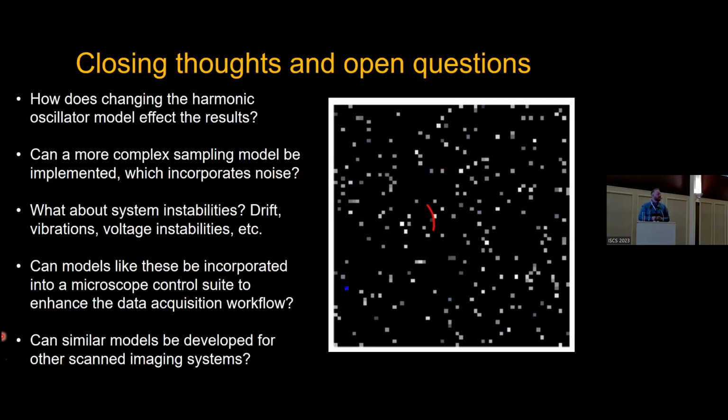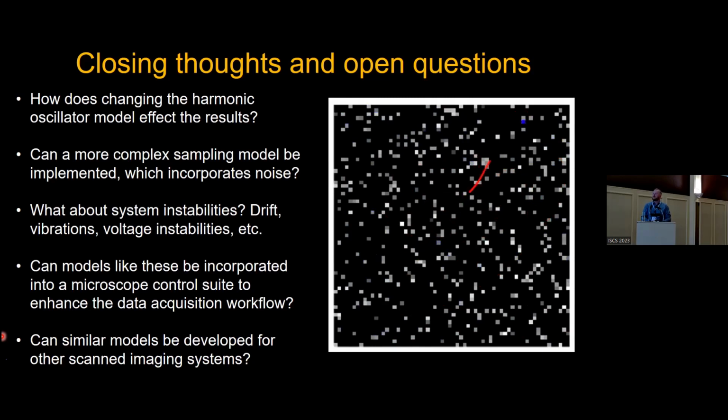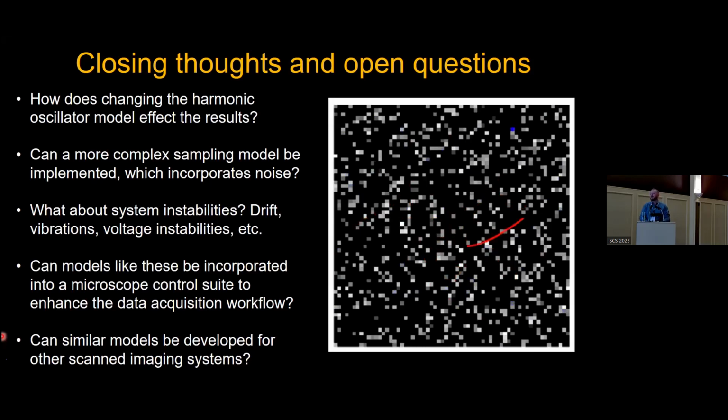I may have one question. Related to the practical use of the model you presented, you say that you can incorporate it. It would be nice to incorporate that into a microscope. Is it more to help control the probe more precisely, or to estimate the true path after the acquisition has been done, to correct it, to estimate what the real path was, or to better monitor it?